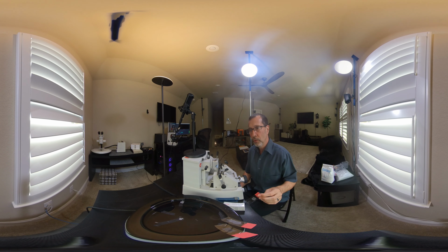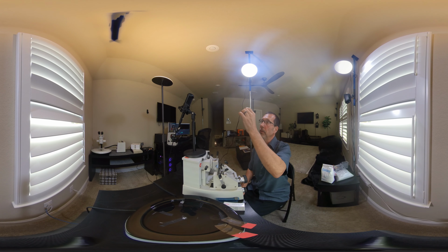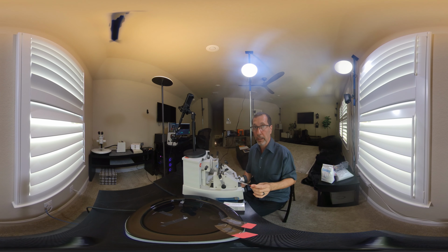So once you remove the paraffin with xylene, it does keep the tissue there, by the way. You would look up in the light and you can see a little speck of tissue on the slide as the tissue remains on the slide, but the wax is removed. And that would be the final step in the histology department. Once it's stained, it goes to the pathologist for review.